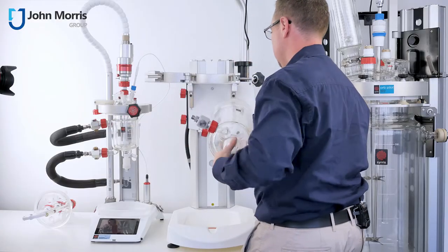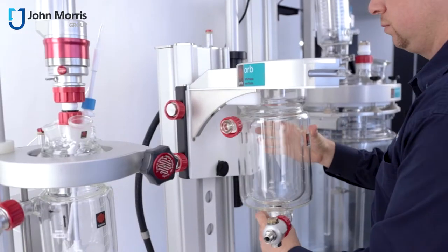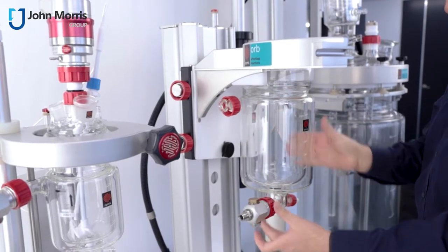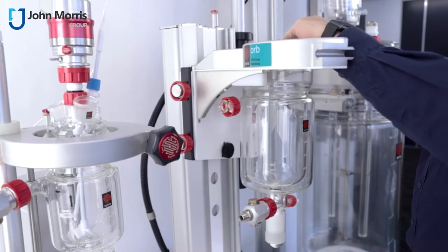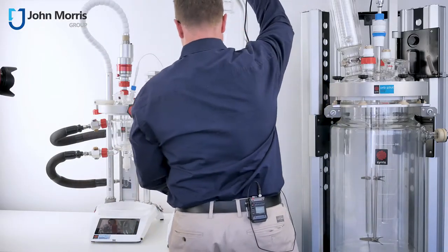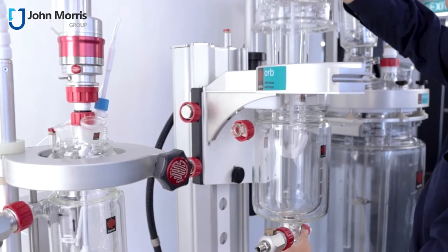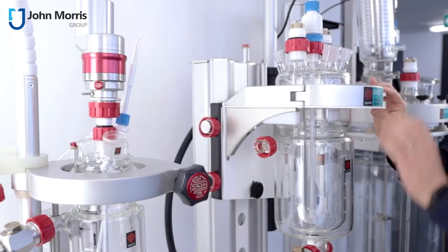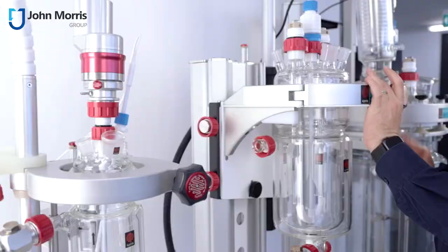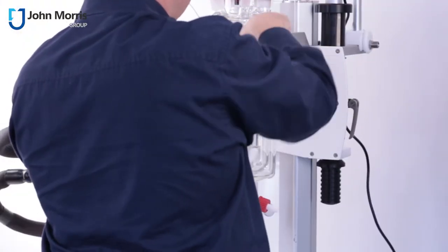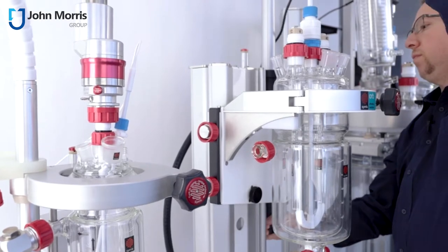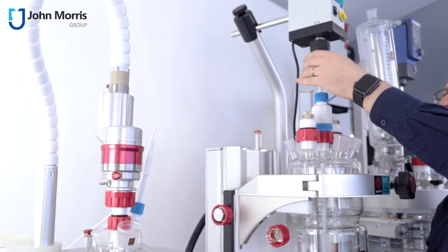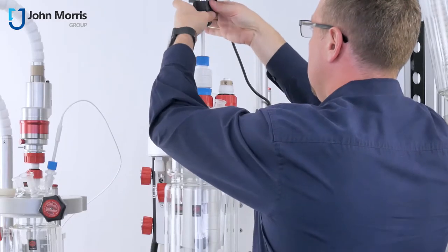So now we're going to slot that reactor back in again and you'll notice it's held in place right here. We're going to put our seals on top and put back on our lid, close it back up and there's that nice ratchet. So you don't have to worry about centering or anything like that or automatically centering. Ratchet style lock in place and away you go.